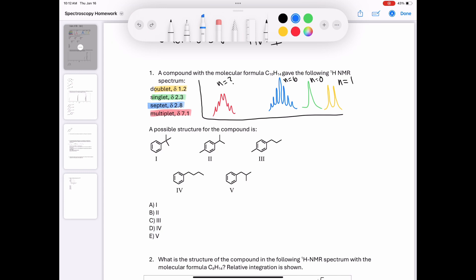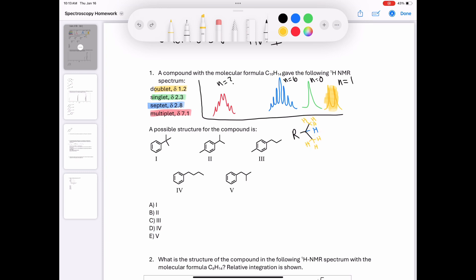Next I'll try to figure out what the rest of these signals could represent. The septet needs to be a proton environment with six neighbors — I'm guessing it's the blue proton, because the adjacent carbons are two methyl groups each with three protons, making six neighbors total. The yellow doublet indicates a proton environment with only one neighbor, so this isopropyl group seems pretty likely given the combination of a doublet and a septet.